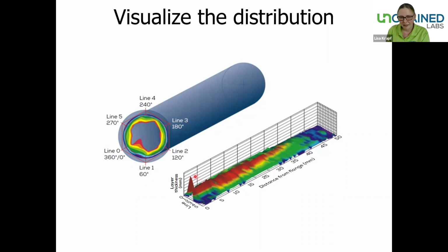And then when you measure several angles, the system will create something like this heat map. So you can see a representation of the layer thickness inside of the syringe, graphically as a map where the height of the silicone layer is color coded.